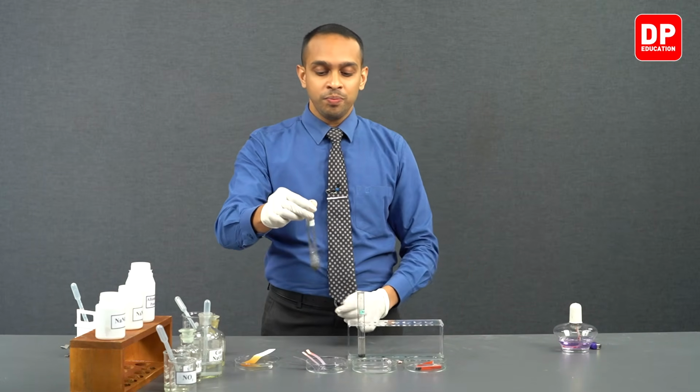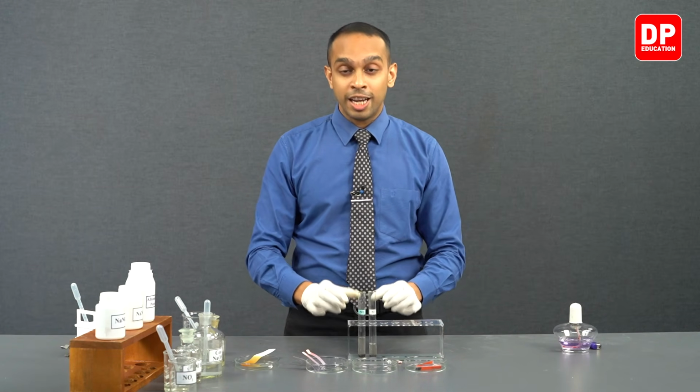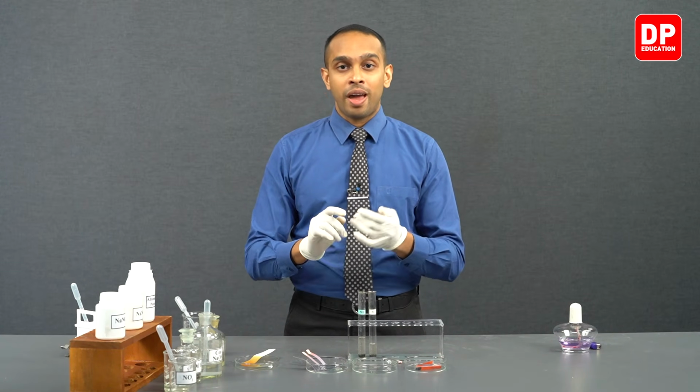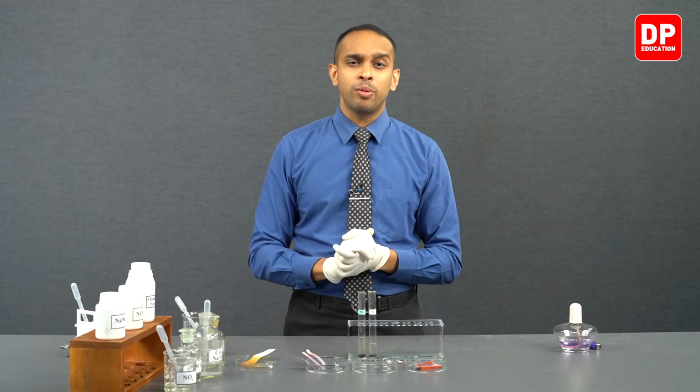So students, we saw how both nitrite ion solutions and nitrate ion solutions are going to react with aluminium powder and sodium hydroxide and produce ammonia gas. The same reaction can be observed if you take zinc powder and react it with sodium hydroxide and nitrate or nitrite ion solution.